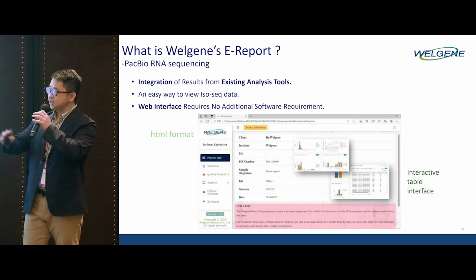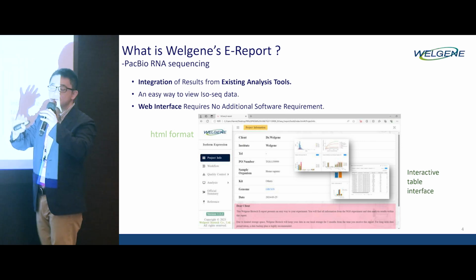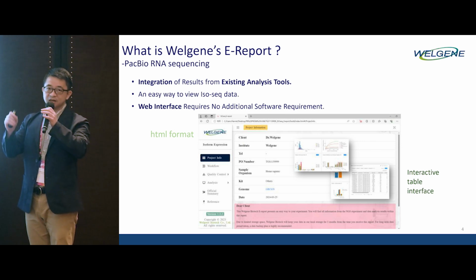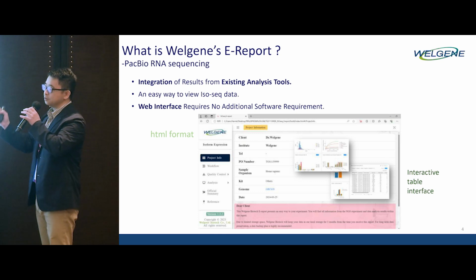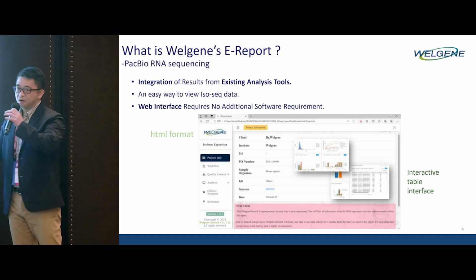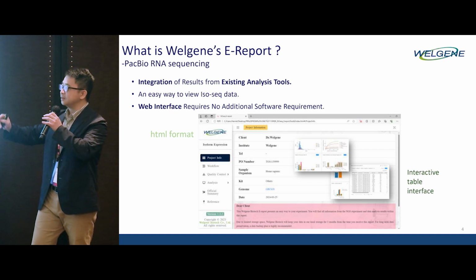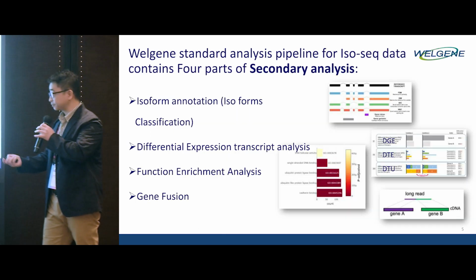This is an HTML file, and you don't require any additional software. You just need a browser, such as Google Chrome or Edge, and you can open Welgene's e-report.